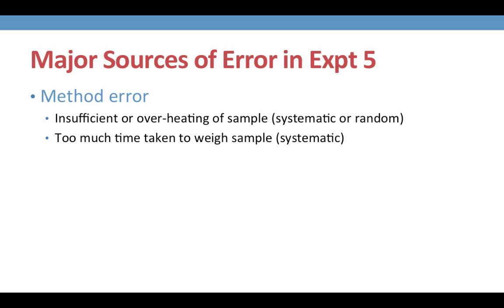On the other hand, overheating of the sample, allowing some of the sample to pop out, would also be systematic, or could be random if it doesn't happen every time. Another method error would be taking too much time to get to the balance before weighing your sample. All hydrates attract water, that is why they are hydrates, and so if we leave an anhydrous salt out in the air for too long, it will begin to gather water molecules back into itself, thereby increasing its mass.